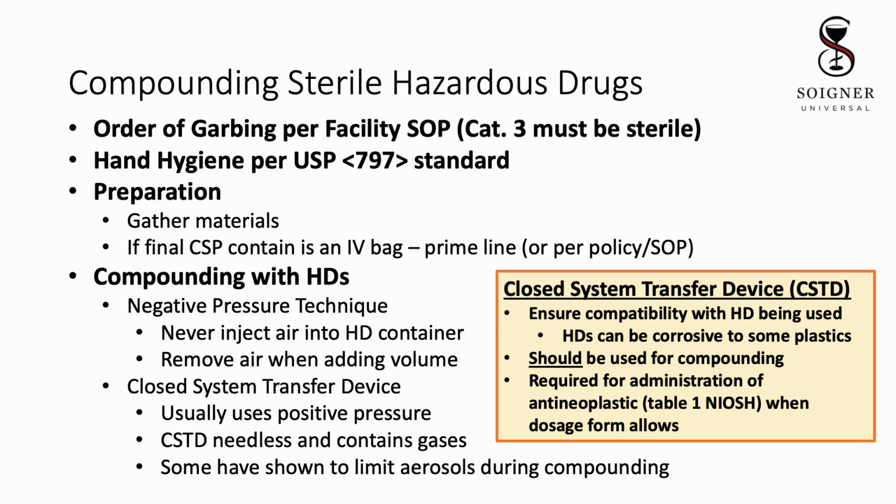Prior to compounding, garb per the facility SOPs for sterile compounding of hazardous drugs using the appropriate PPE. In preparation, ensure that all components are gathered and disinfected, and if an IV bag is used, prime the line prior to compounding, or follow the facility SOPs.